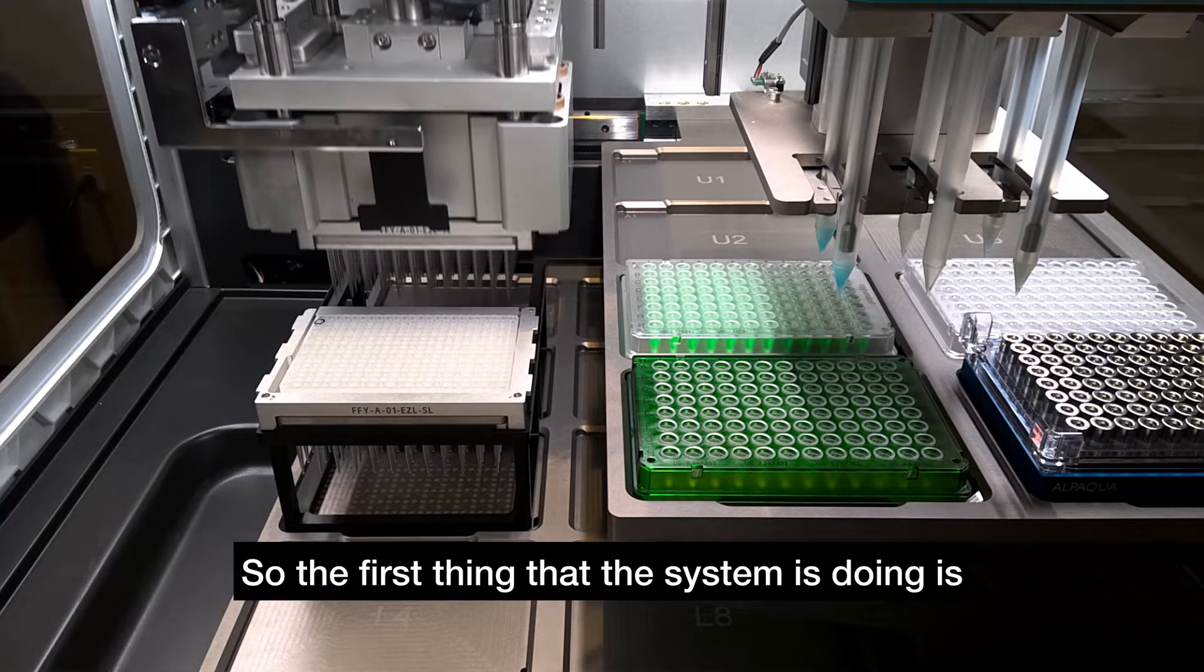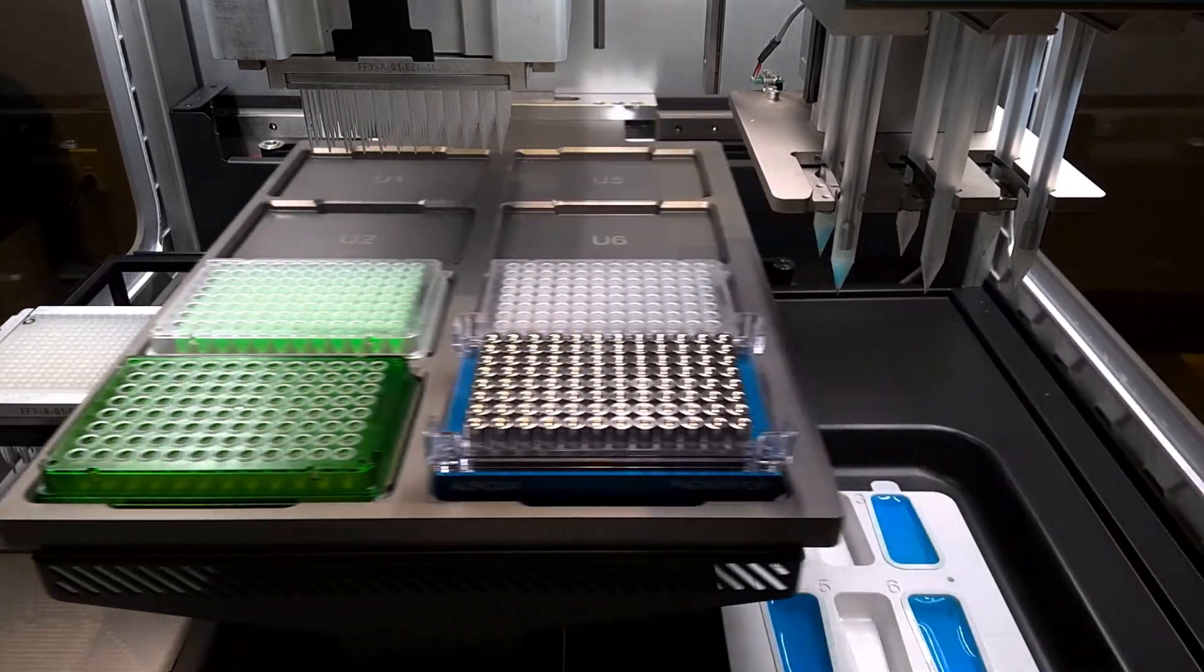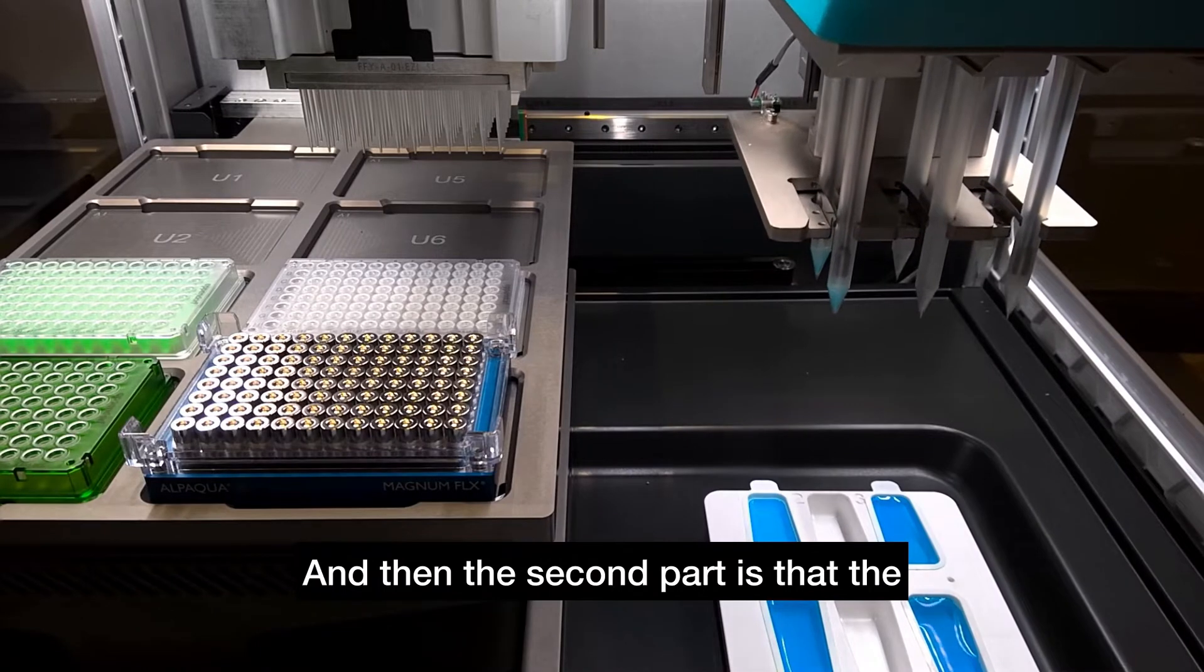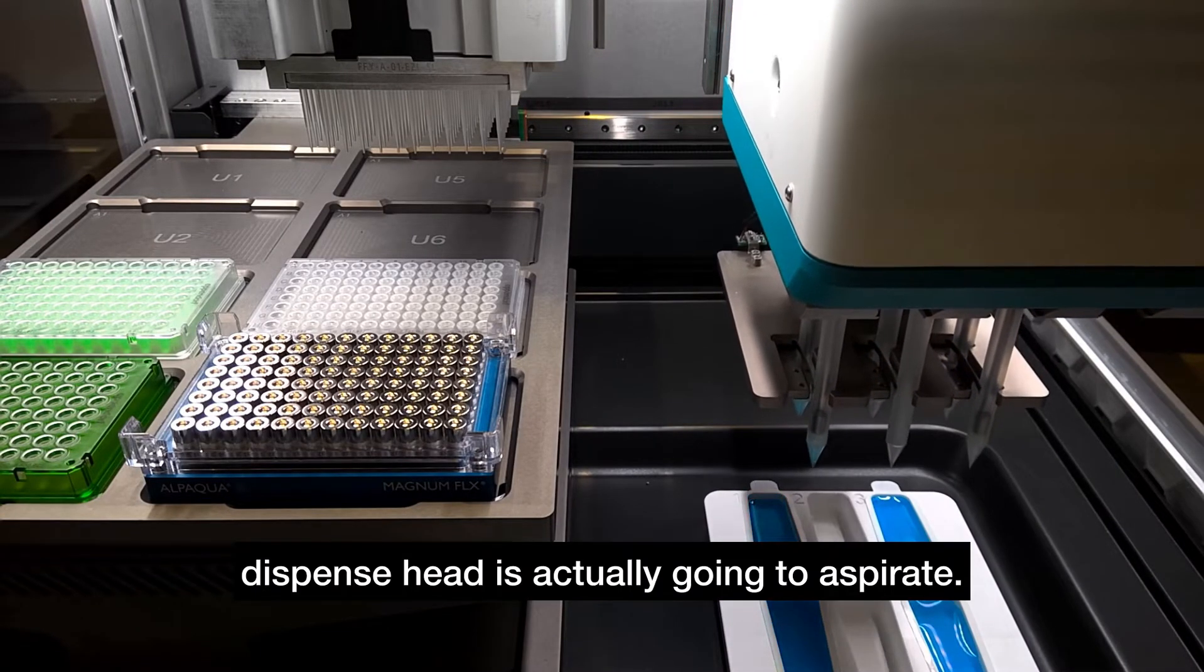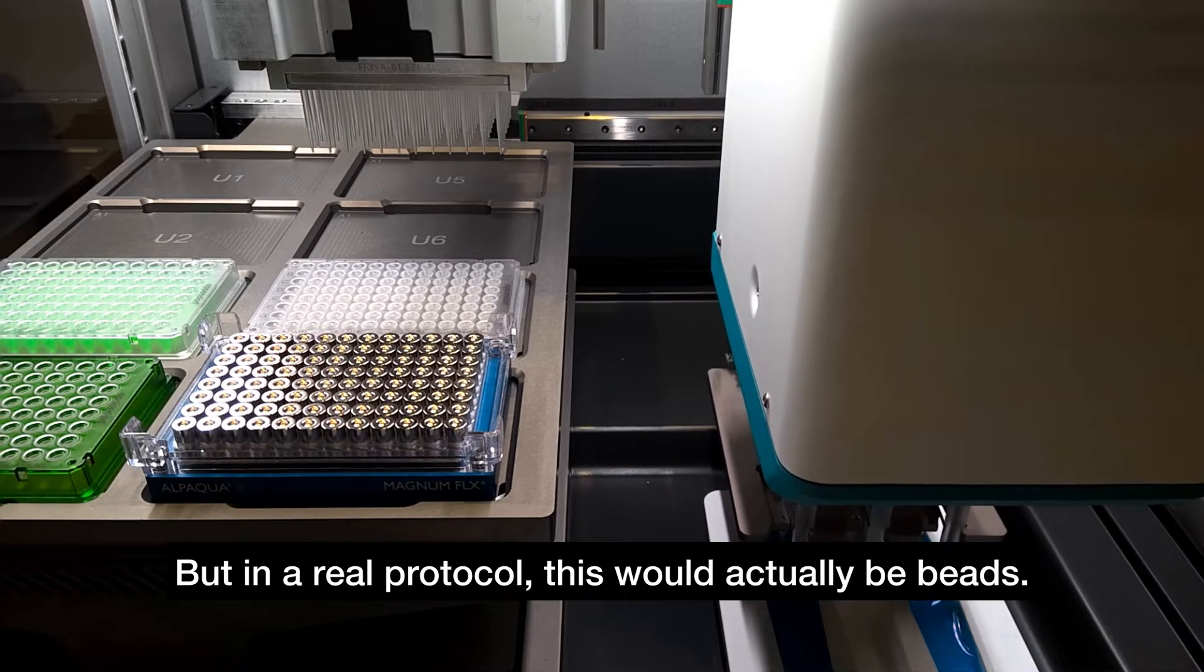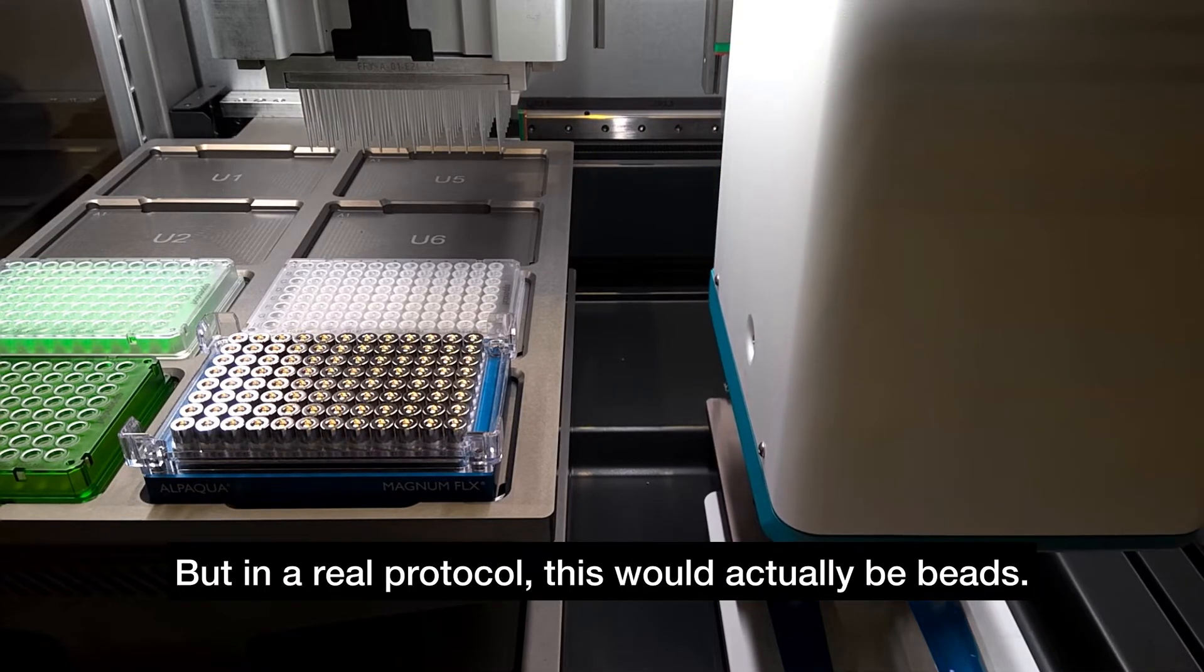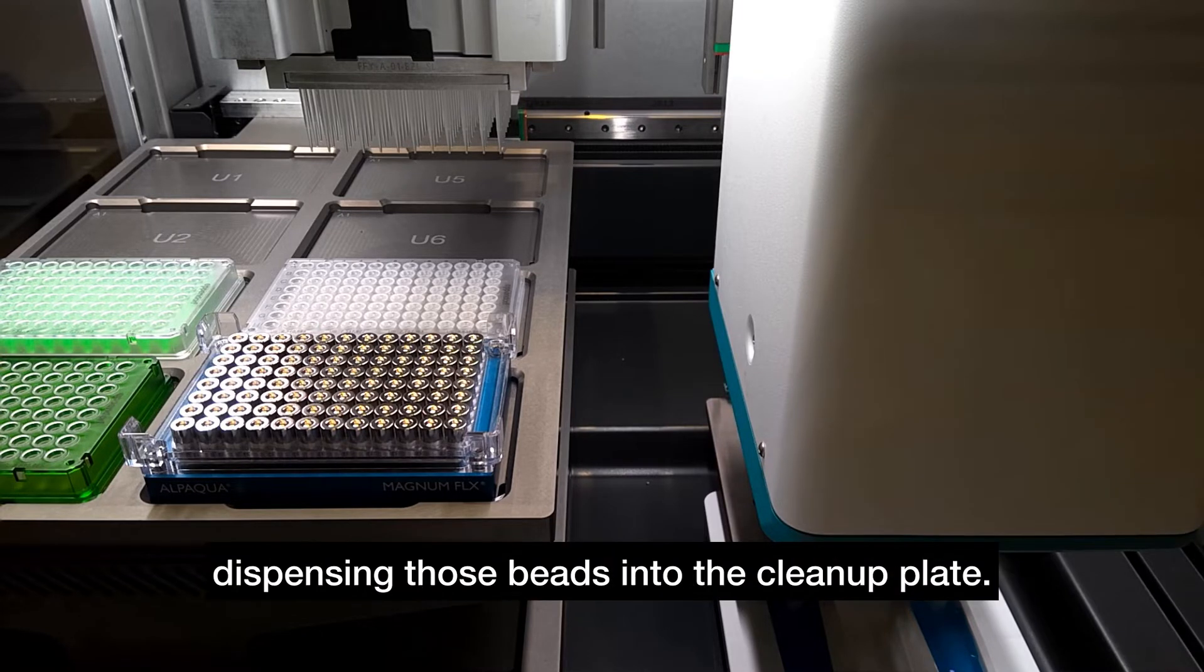So the first thing that the system is doing is picking up a fresh set of 96-well tips. And then the dispense head is actually going to aspirate. In this case, this is just colored blue liquid, but in a real protocol, this would actually be beads. So it's just going to aspirate ready for dispensing those beads into the cleanup plate.